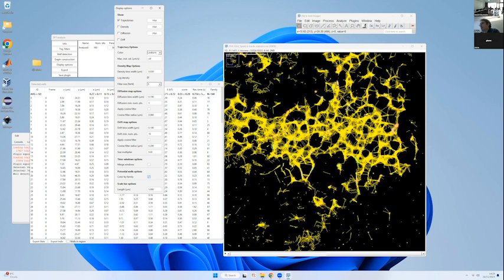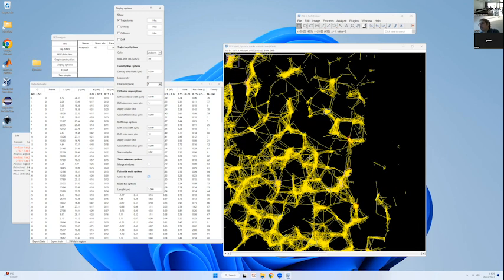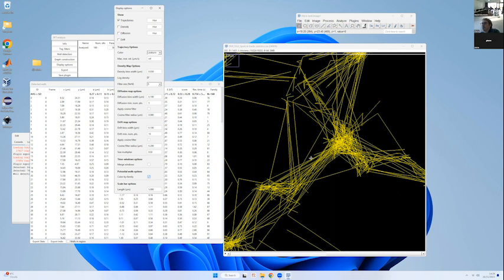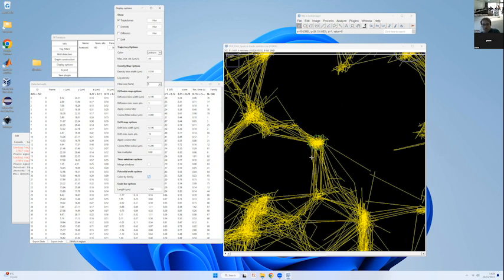And that's how Pierre did this linking between the wells, so that you see how persistent they are. Here we didn't click on the option, that's why you didn't get it. Nobody has it. Okay, you forgot to tick the time window.